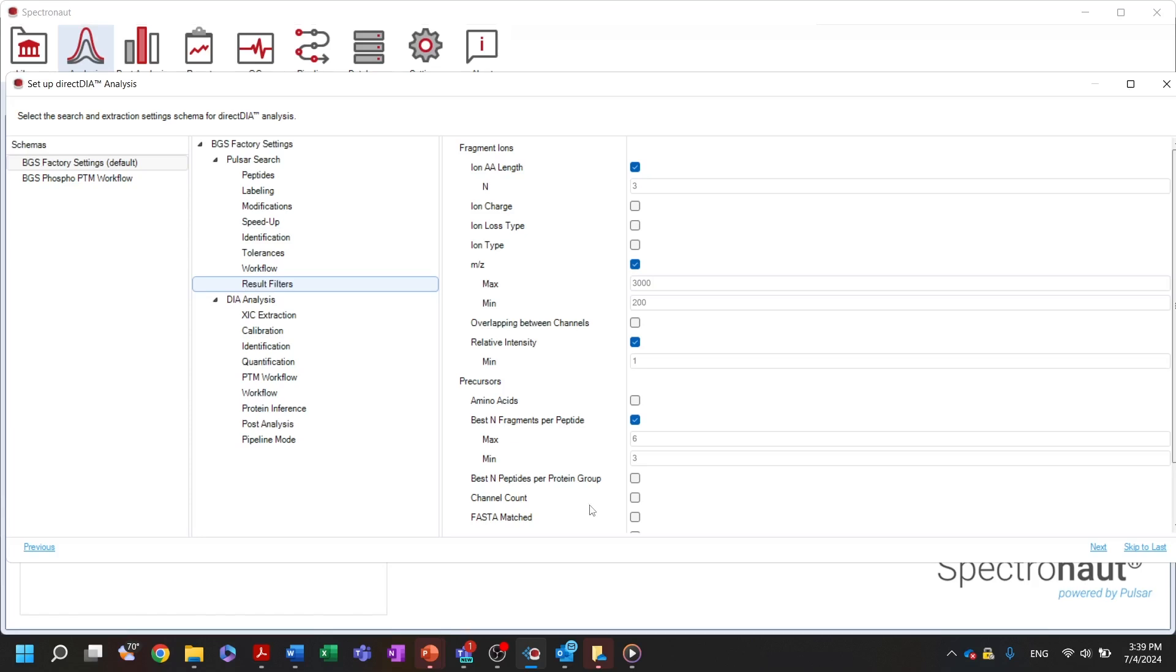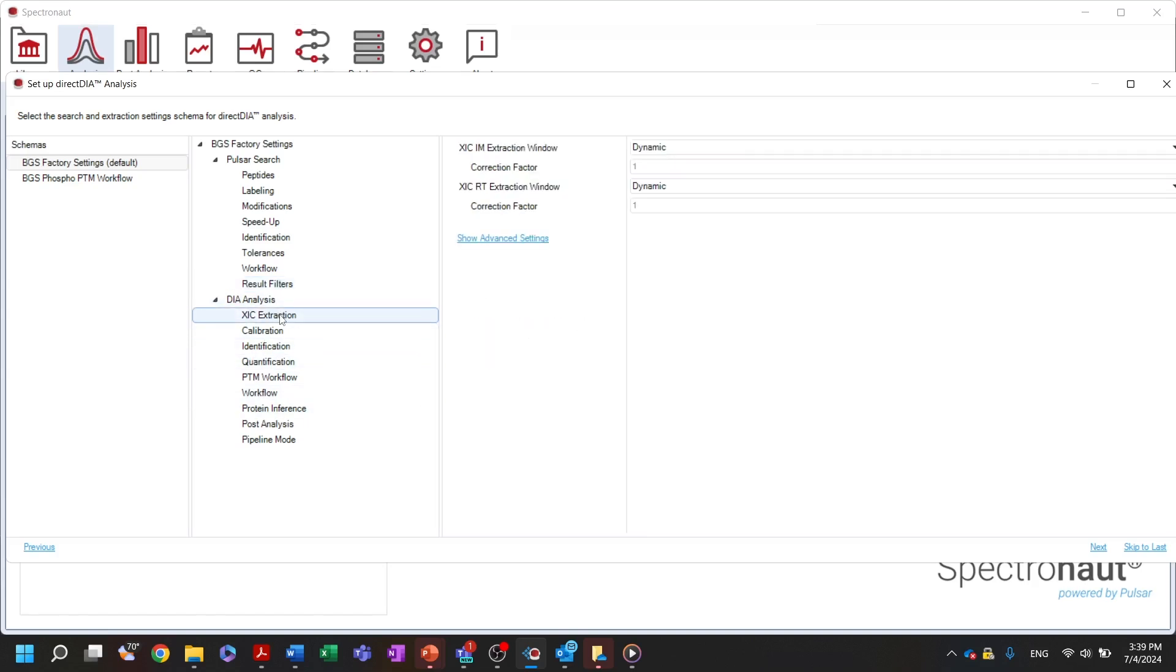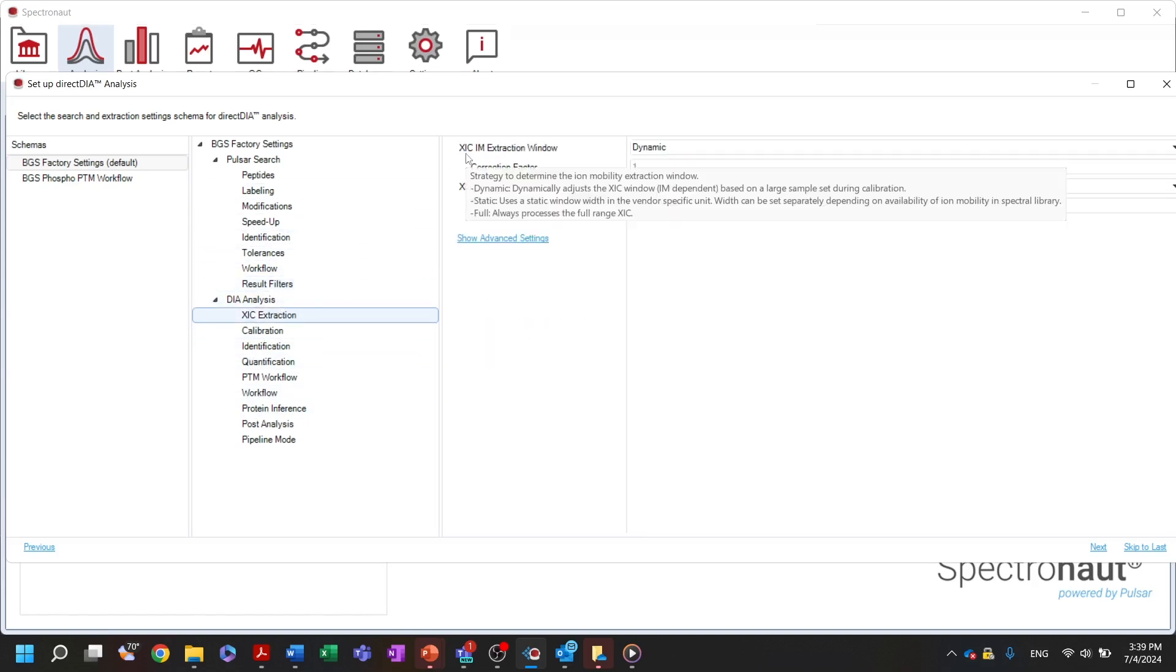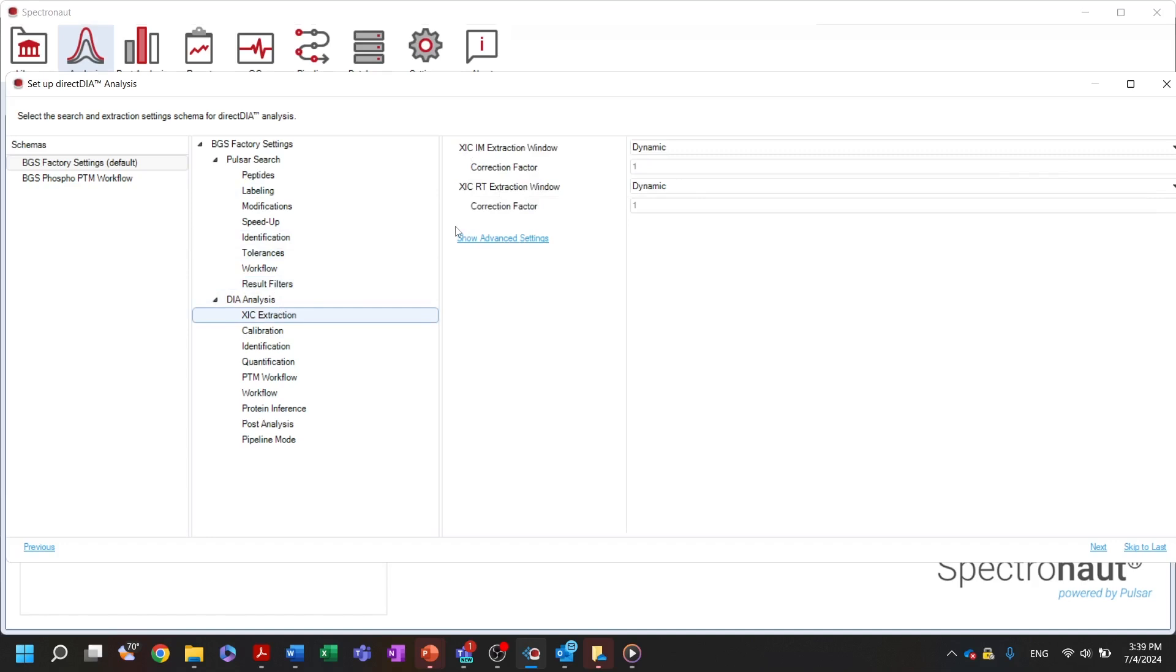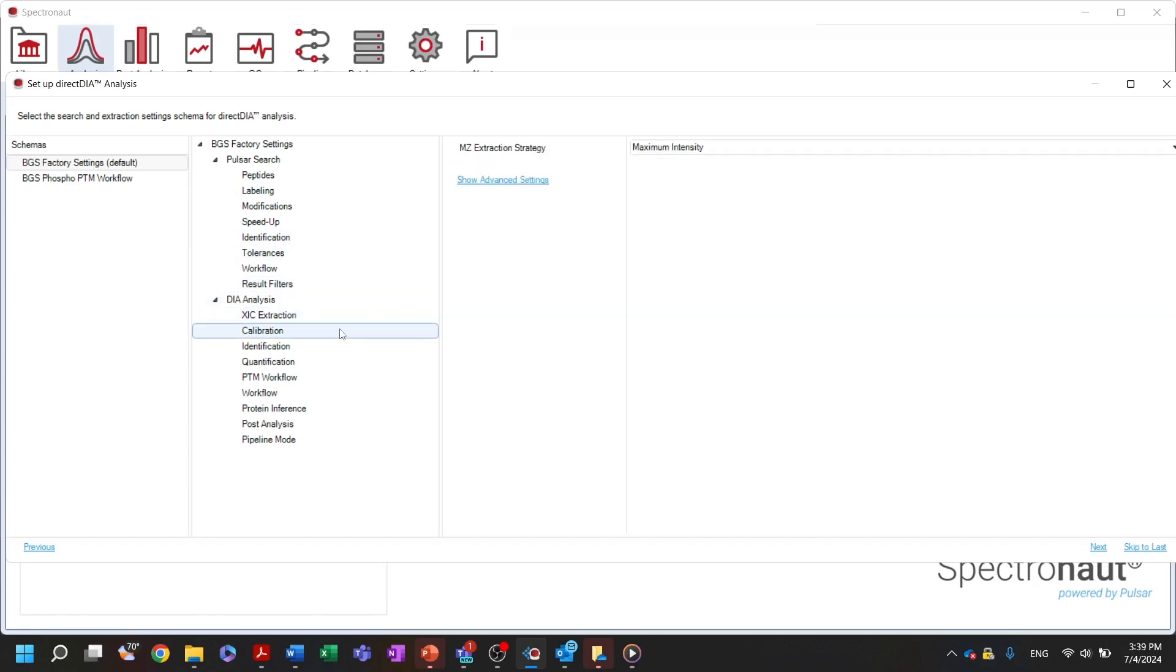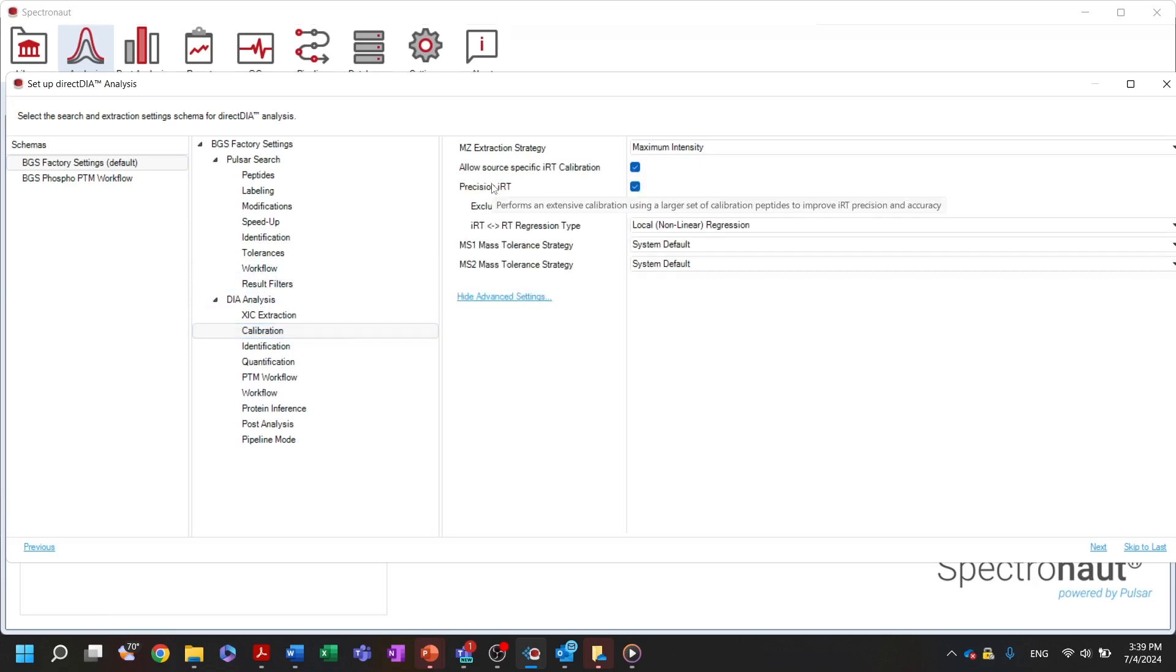Let us move on to the second part of the direct DIA settings. Here you can select settings to define XIC extraction tolerances and to adjust the calibration process. Note that DIA analysis in Spectronaut does not require spiking in IRT peptides, but we highly recommend their presence for quality control purposes.